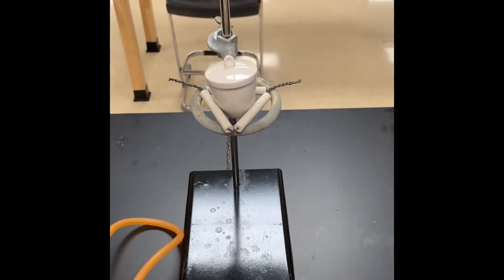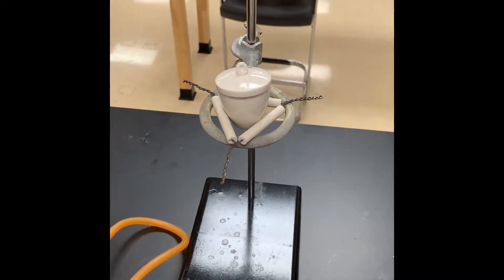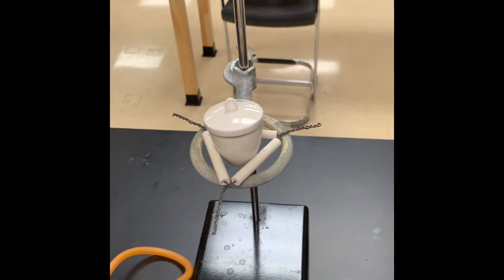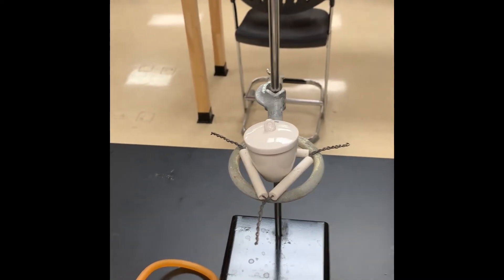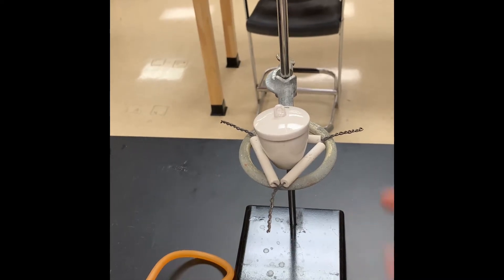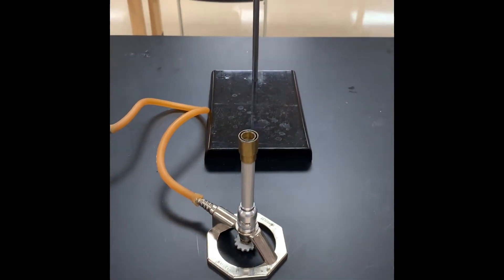I want to show you the setup we have going on here, and then I'm going to tell you what I'm going to do first. So here I have a crucible and lid, and that's what I'm going to do my reaction in today. It is resting in a clay triangle, which is resting on a ring clamp, which is then on the ring stand. I then have a Bunsen burner that I'm going to light here in just a minute using my striker.